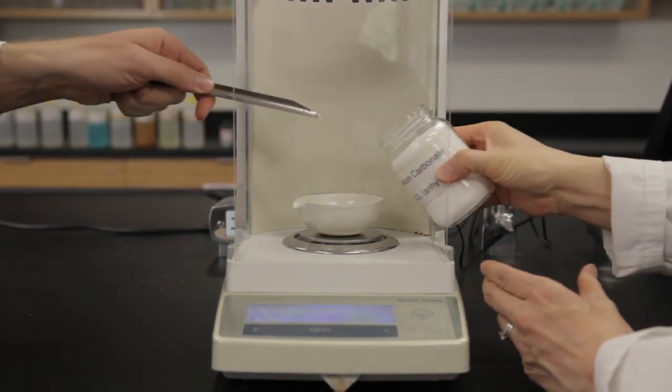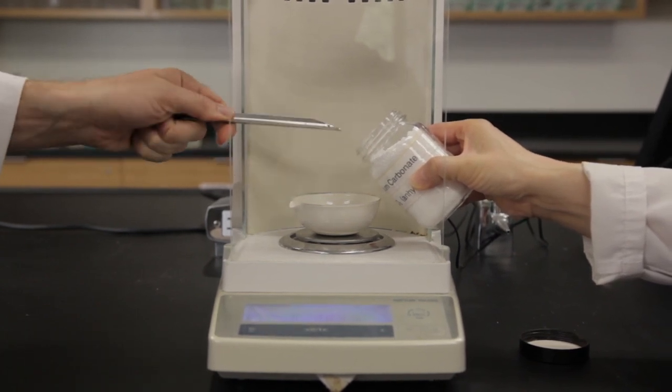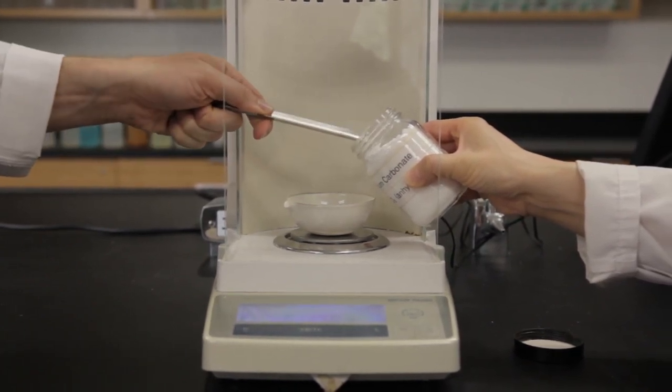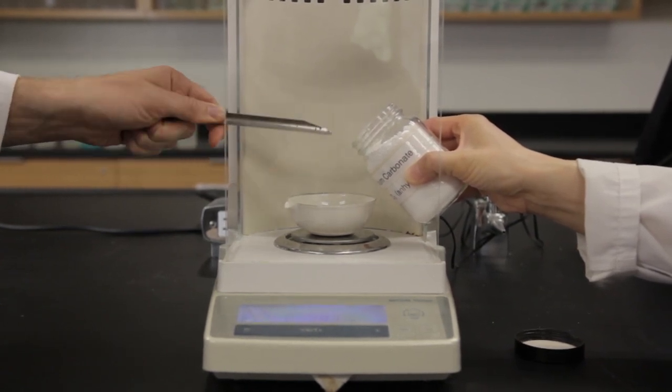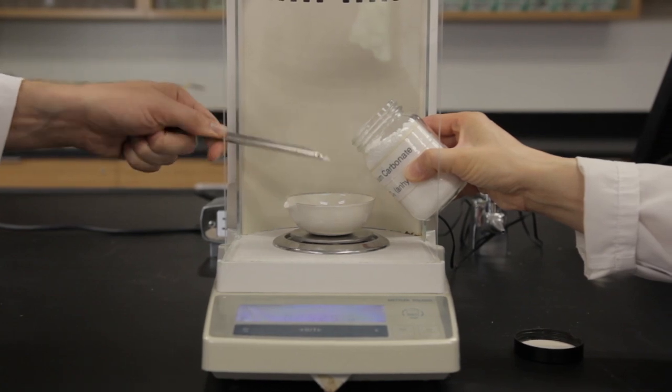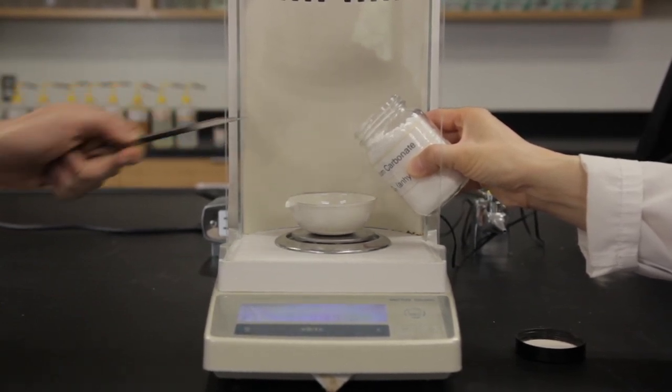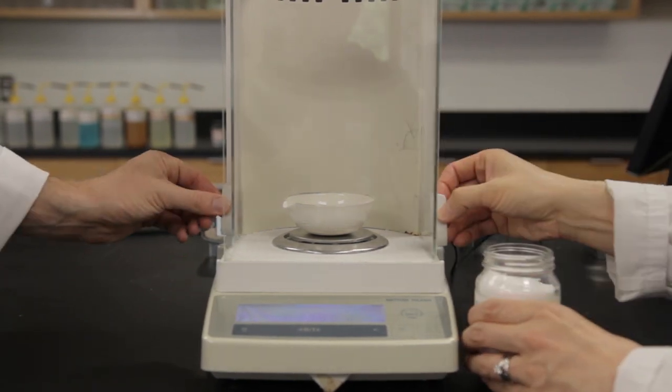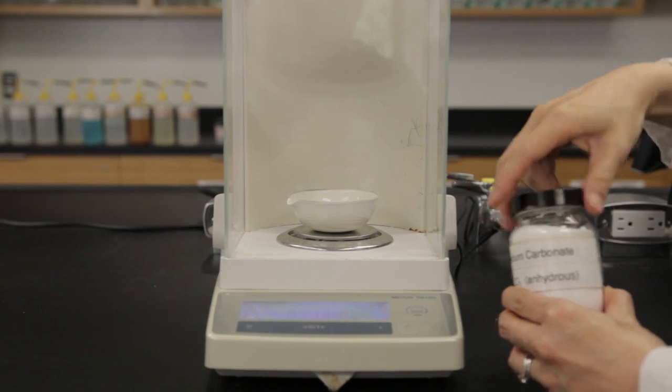Tare the evaporating dish and weigh approximately 0.3 grams of sodium carbonate. Record the exact mass, making sure to record every single digit shown on the balance.